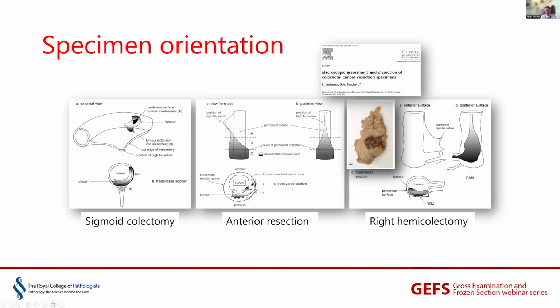Of course, if it has an abdomino-perineal resection, which isn't illustrated here, you'd have additional tissue at the bottom here with the anal canal. And I've got some pictures again from the data set, in fact, in the next few slides to illustrate that for you in a bit more detail.